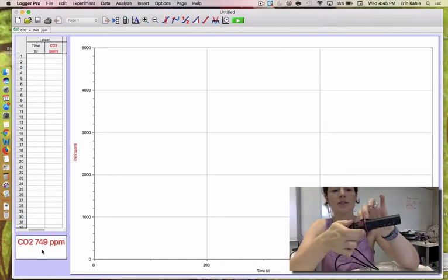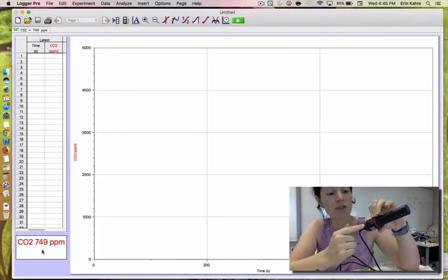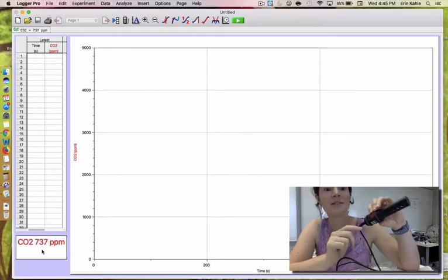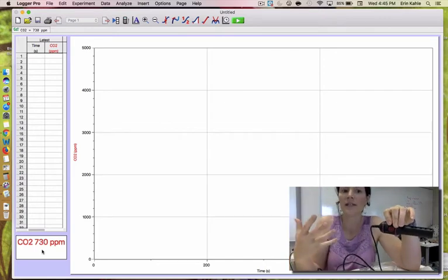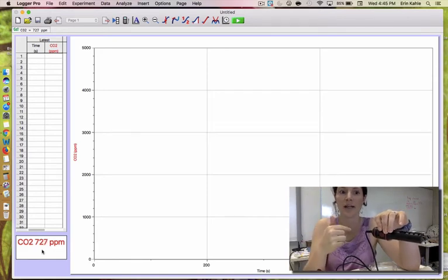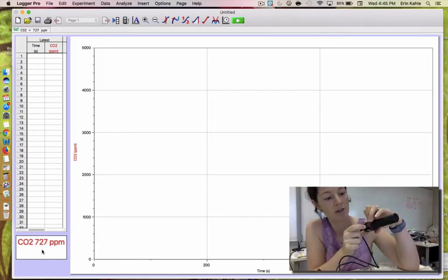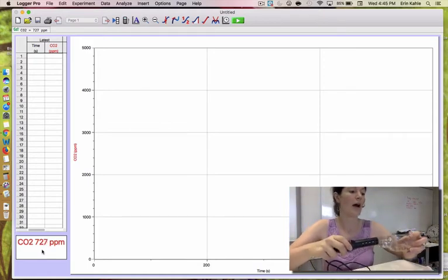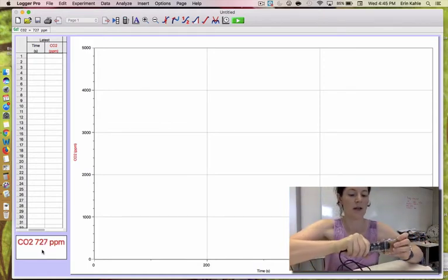Just so you know, the CO2 sensor has 2 settings. If we're talking about beans producing CO2, you probably want to use the lower setting, which is anything up to 10,000. If you're using the CO2 probe to measure CO2 expelled in somebody's breath, you would want to use the higher setting. So make sure that it's on the lower setting, 0 to 10,000.